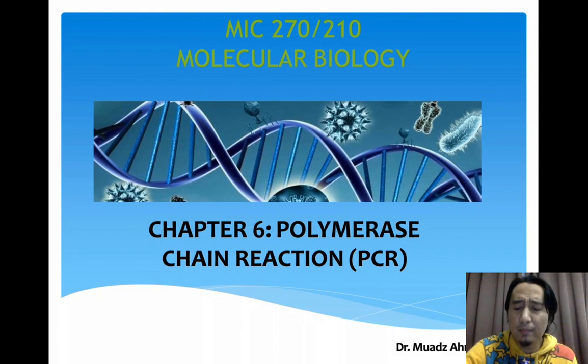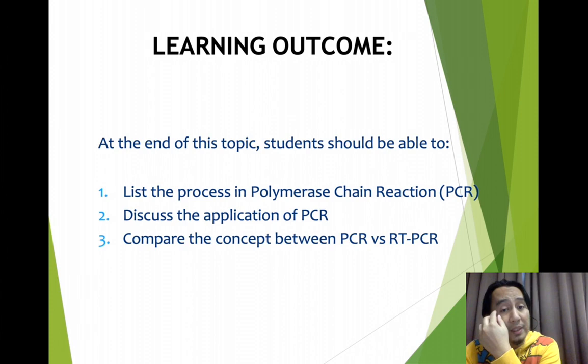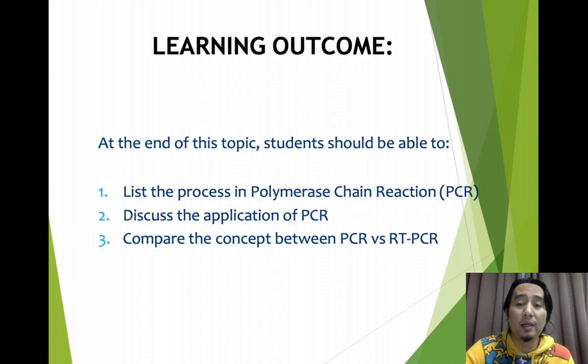Today, I'm going to explain to you the process that involved in PCR, and also I will discuss a little bit applications on the PCR. And last one, we will compare the concepts between PCR and RT-PCR that become more famous. And since this is the COVID-19 season, so to recognize COVID-19 in a patient, we use a PCR. Mainly we use RT or QRT PCR to detect detections of COVID-19 in a patient.